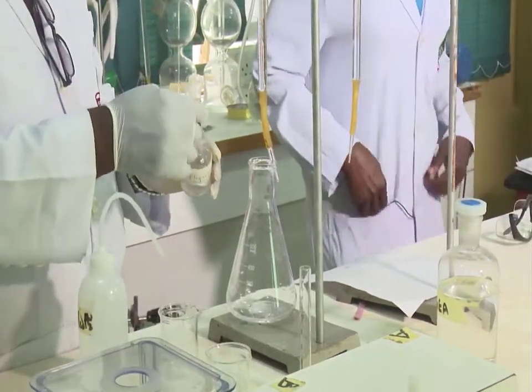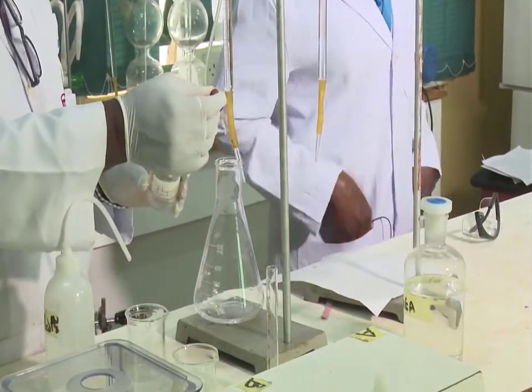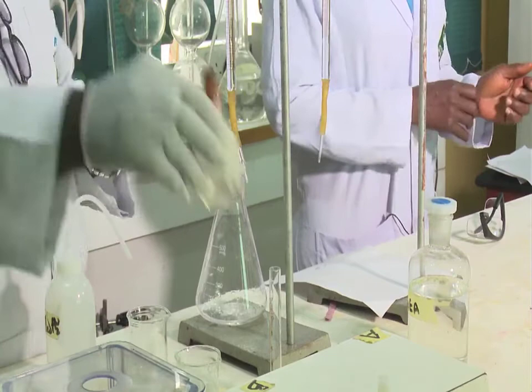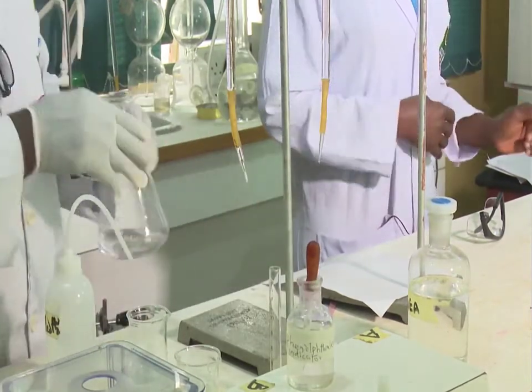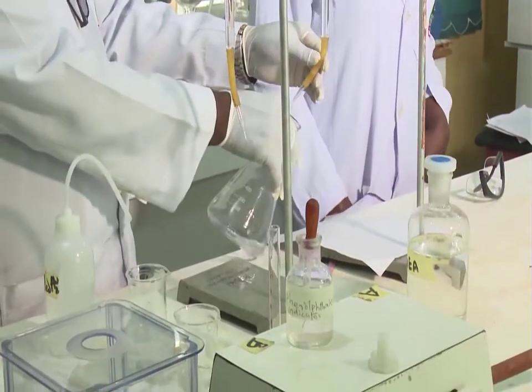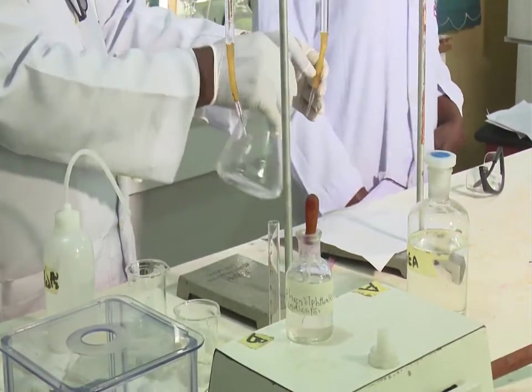Add 4 drops of phenolphthalein indicator. Please observe the color change of the vinegar solution.